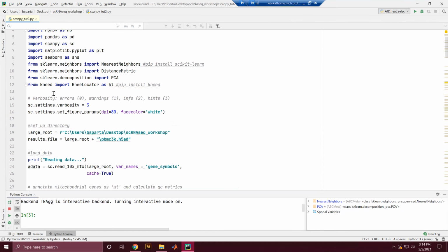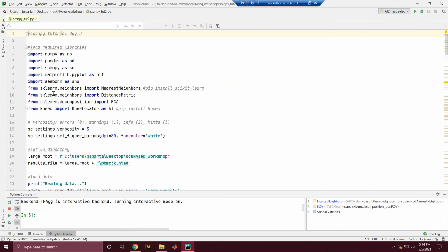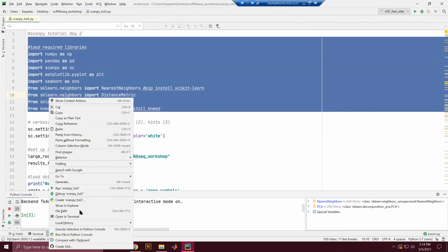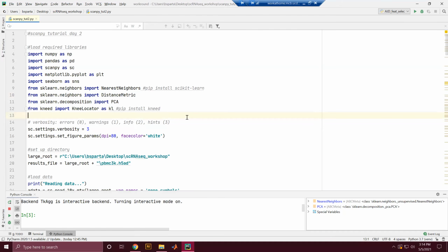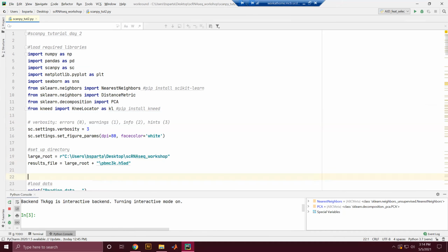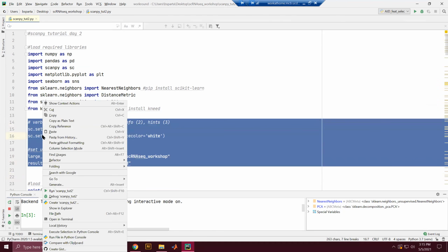I'm choosing to run this line by line. So I just highlighted the libraries and can import them. If you right click, you can see the command. For PyCharm, it's Control-Shift-Enter. So I'll go through this. Oh wait, Control-Shift-E. Alt-Shift-E.